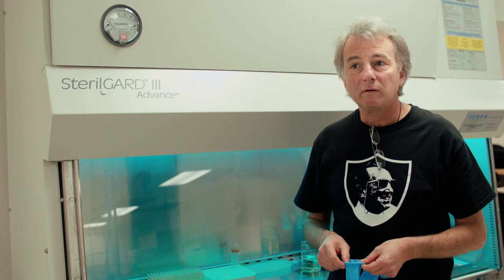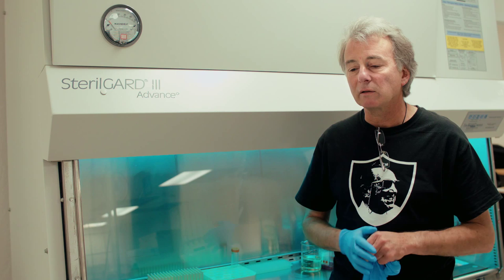So our HIV virus arrived. It's a strain that is common in the literature, so that's why we're using it.